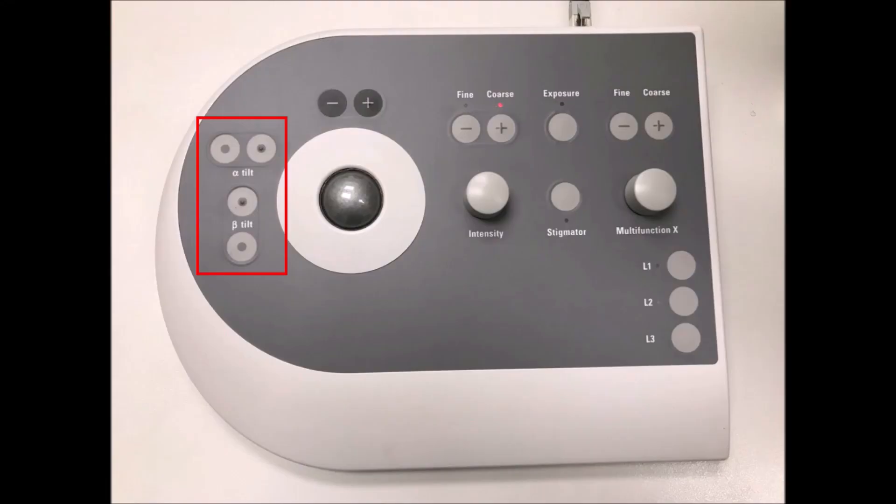And we can see in this diffraction pattern that I have a very evident open Lowey circle. So now I want to use my alpha beta tilt controls on my left-hand panel to close the Lowey circle and to get to that criterion where every Bragg spot and its opposite has the same intensity as viewed in the diffraction pattern.